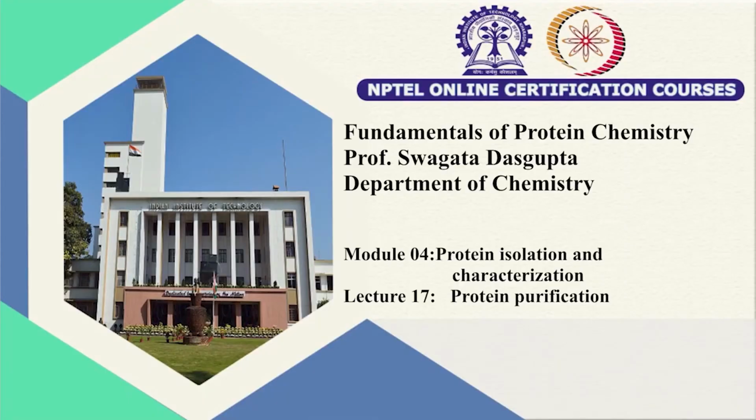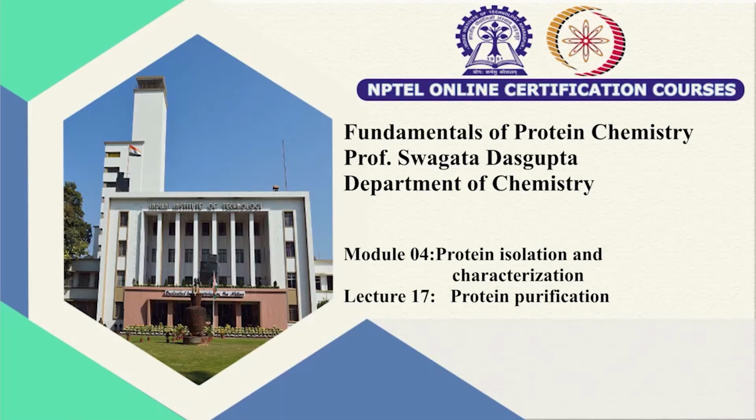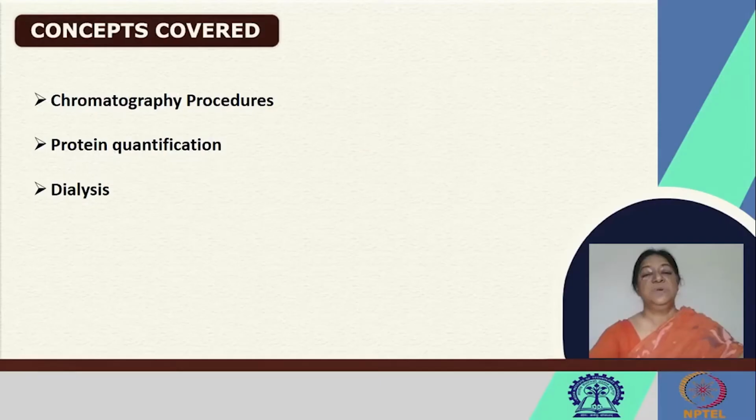In the second lecture of Module 4, which deals with protein isolation and characterization, we will be looking at protein purification protocols. In the previous lecture, we have looked at salting out, centrifugation, and some idea about sedimentation techniques. In this lecture, we will be looking at specific aspects of chromatography procedures, protein quantification, and finally dialysis.